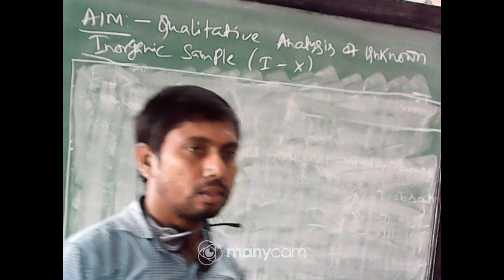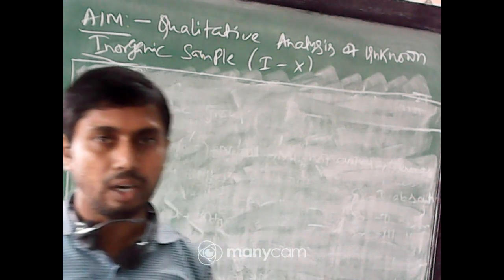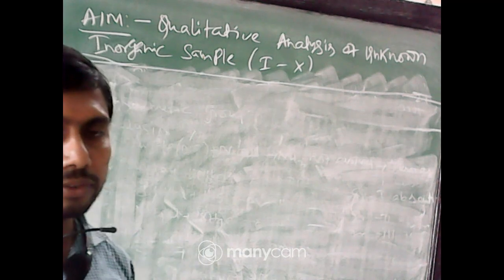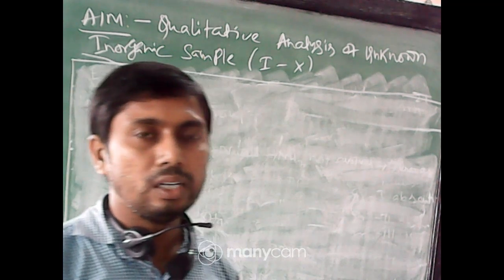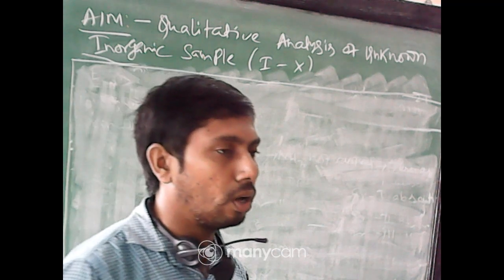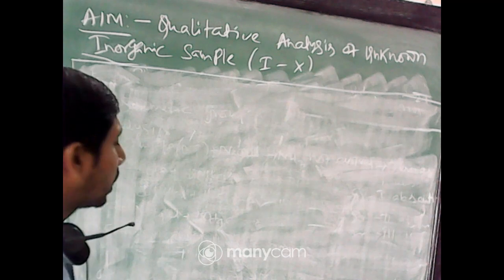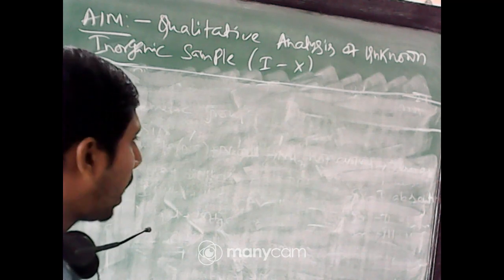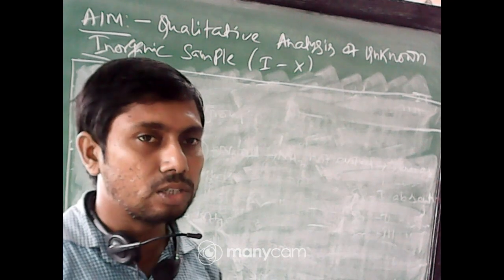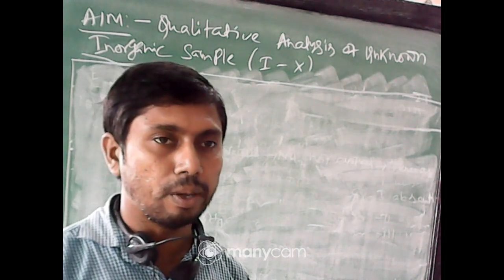Today's class is also a practical class. Now today we want to discuss at first the qualitative inorganic analysis. The title you can see on the board: qualitative analysis of unknown inorganic sample, marked as IX. This is just the title, as you have to write in your copy or also in the question paper.